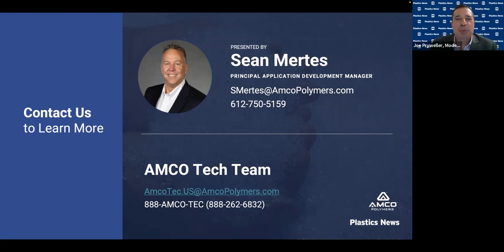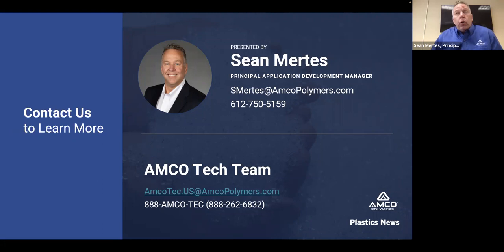Do colorants, slip agents, and other additives substantially impact a DMA curve? Sounds like an interesting question. Anyone? More so on your crystalline resins. Because your crystalline resins, we talked about crystallinity, nucleants, they add as a nucleating agent. So your fillers, your colorants, your phthalo blues, your reds, they work as a nucleating agent. So absolutely 100% on crystalline resins.